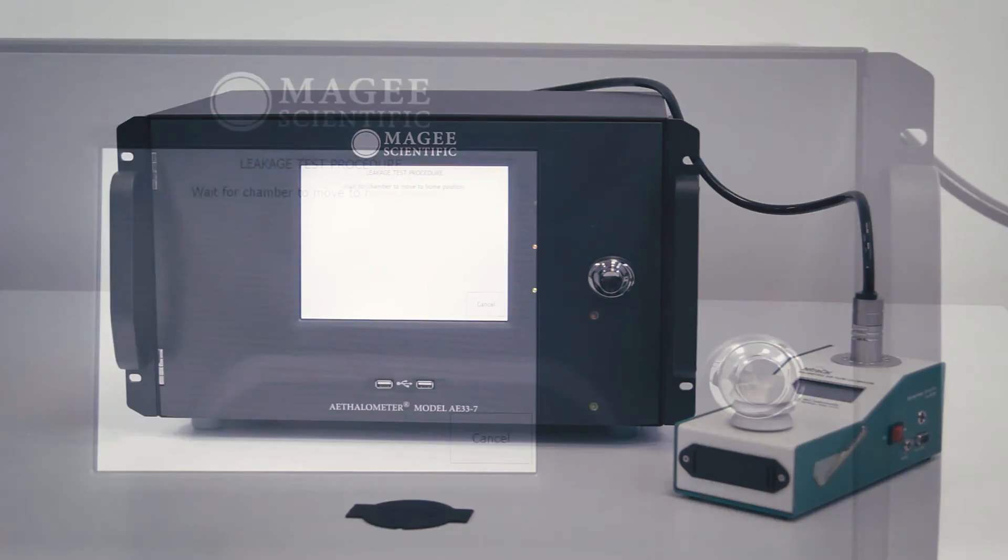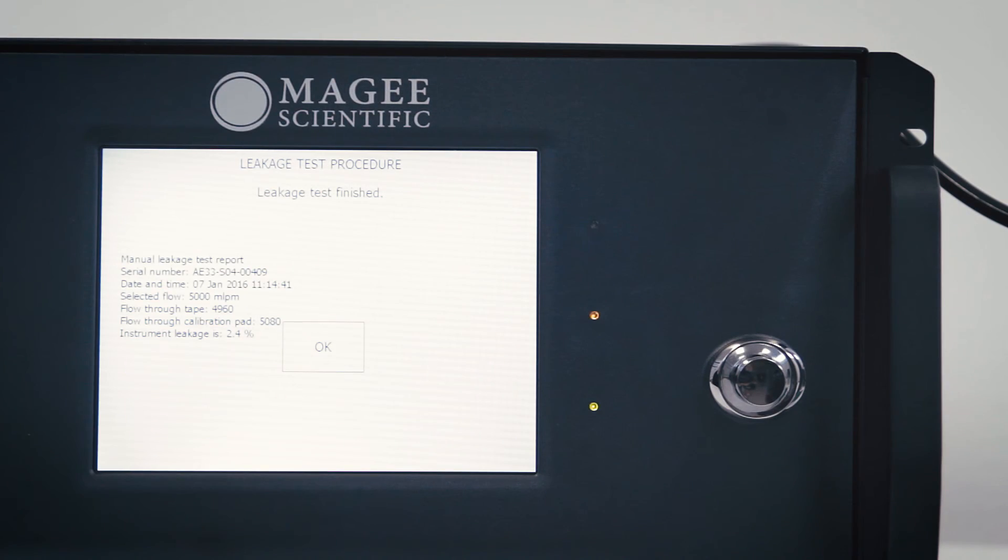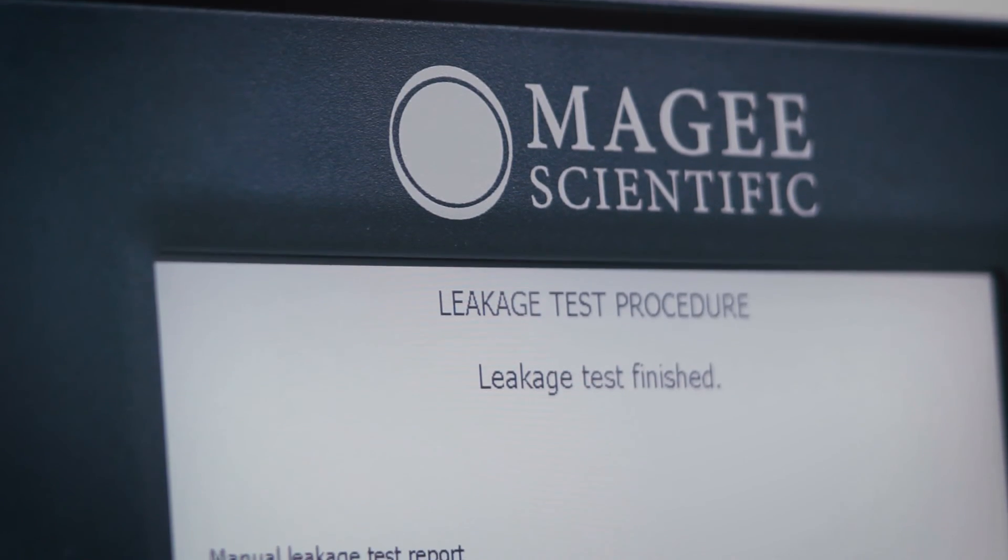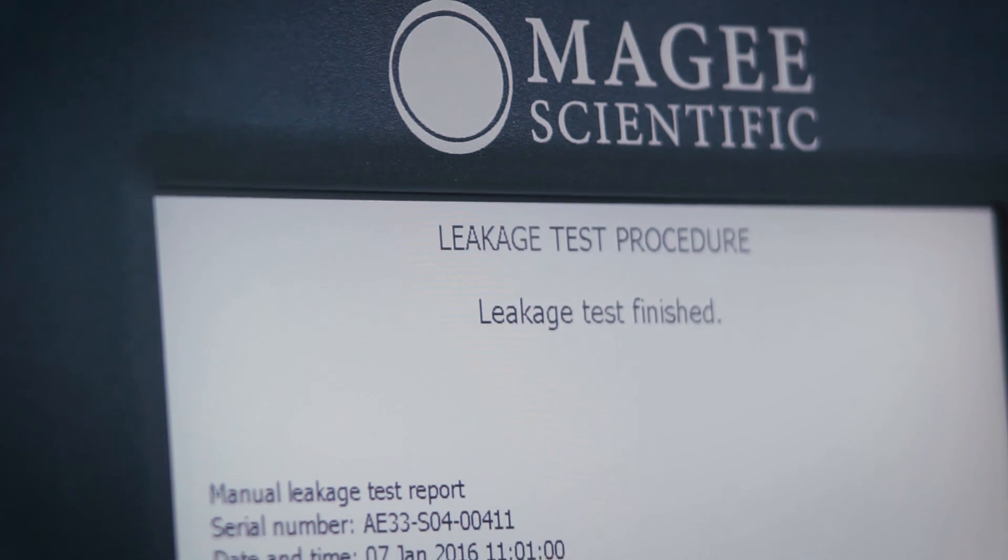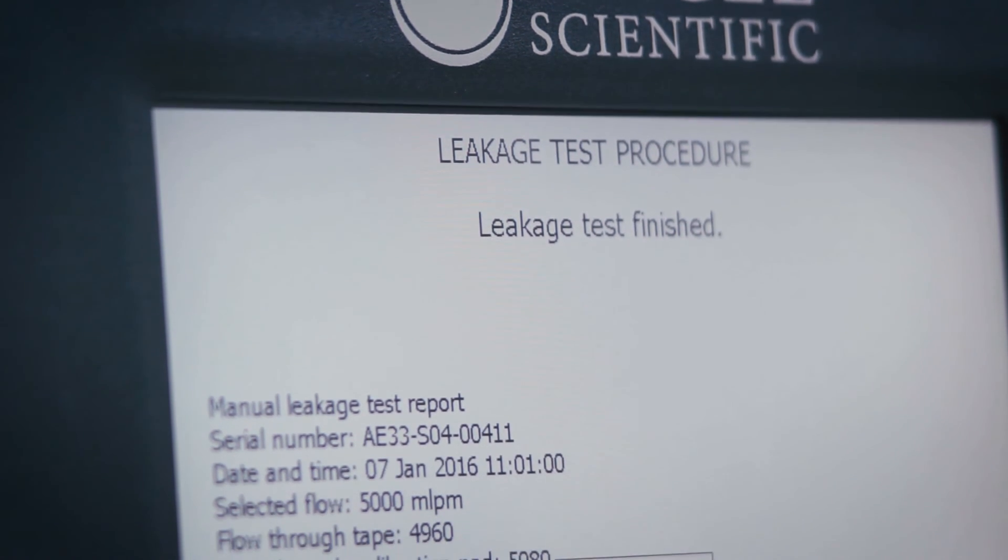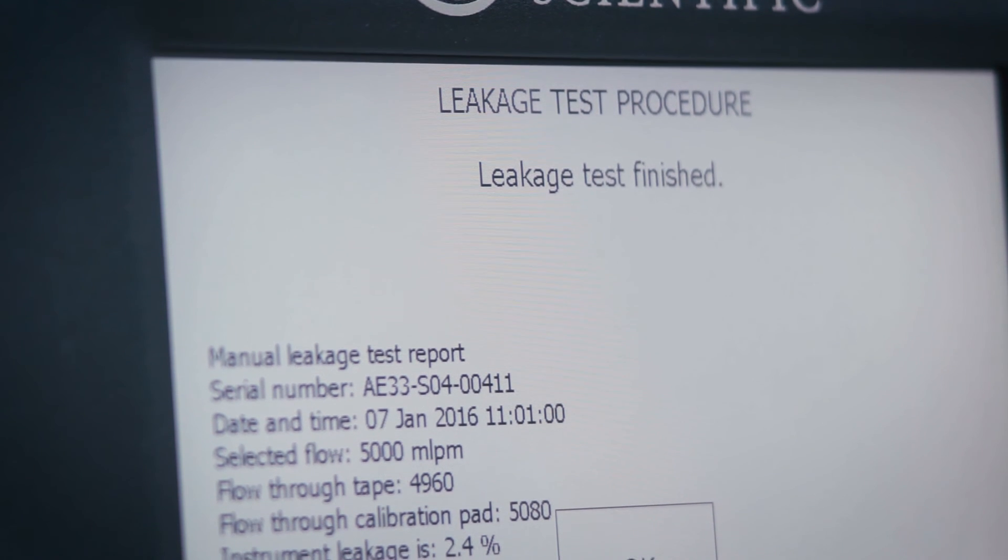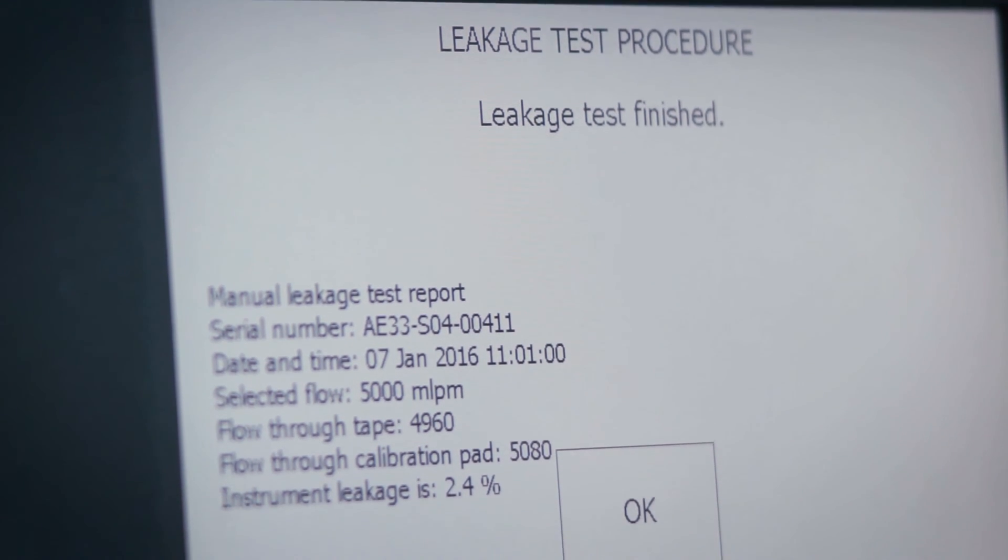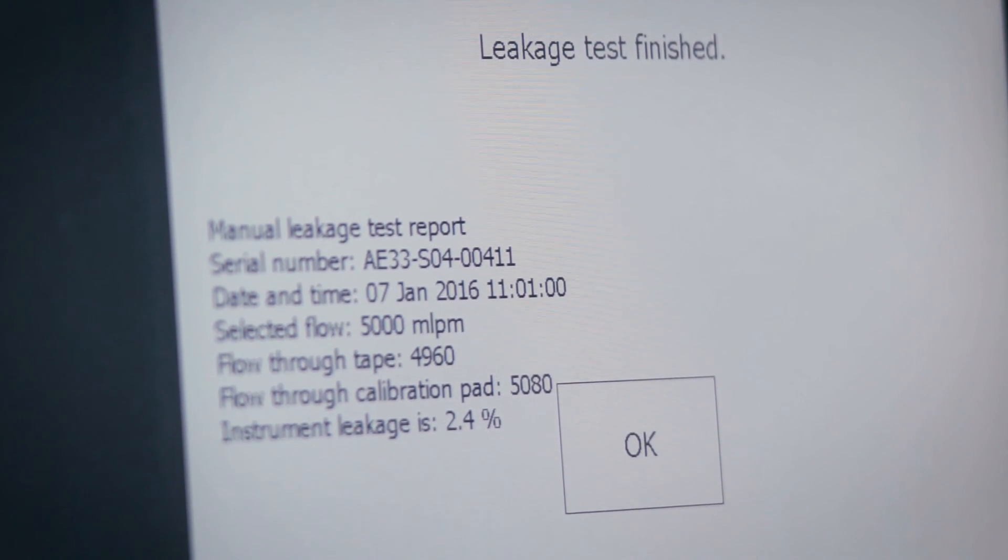The test is now completed. The report shows the selected flow and flows through the filter tape and calibration pad. The leakage should be less than 10%. If the reported leakage is larger than 10%, please contact us as soon as possible.